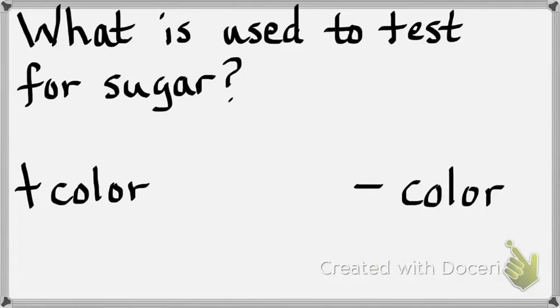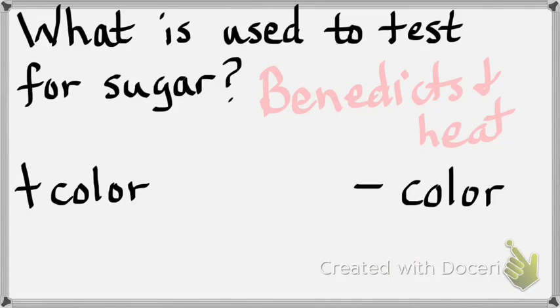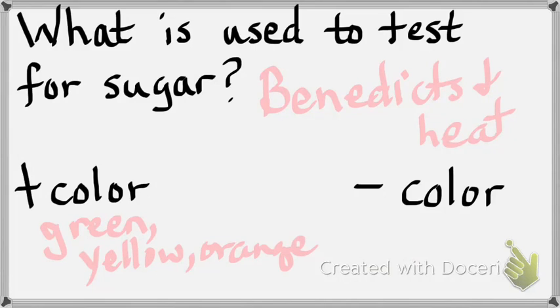Okay, from page 40, what is used to test for sugar? Good, Benedict's and heat. You do have to heat. Okay, there are many positive colors. What are they? One negative color, what is it?